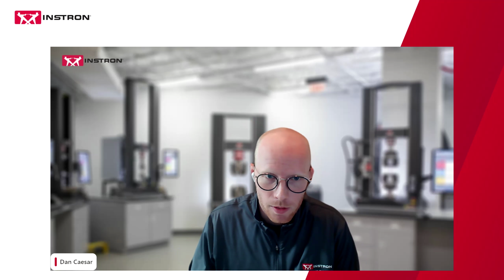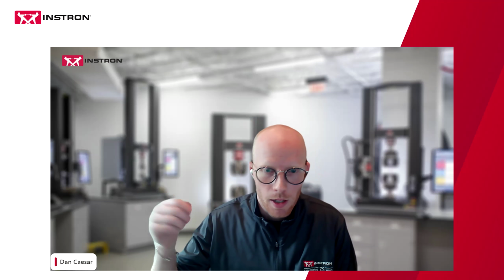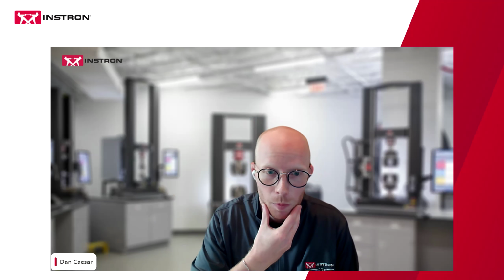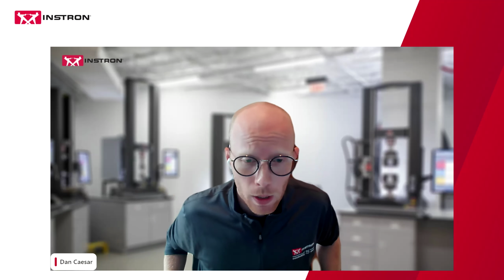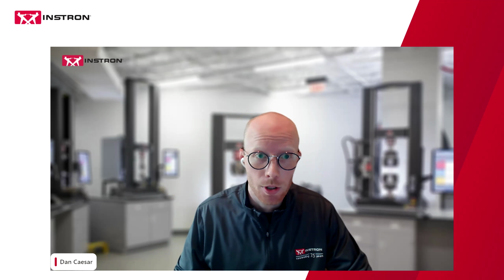Second question about reference material at the conclusion of the event. Certainly, all of the things that I reviewed will be on our Bluehill Universal webpage, Bluehill Central webpage, where we list the features that have been introduced.